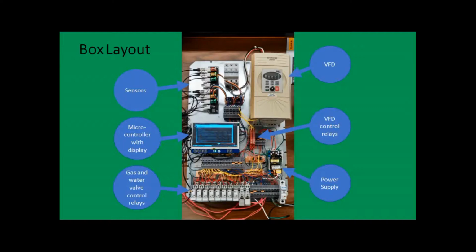The system controls water and gas valves with relays. These valves control water flow, pH, and dissolved oxygen levels throughout the photobioreactor. The valve control is autonomous and depends on collected sensor data.